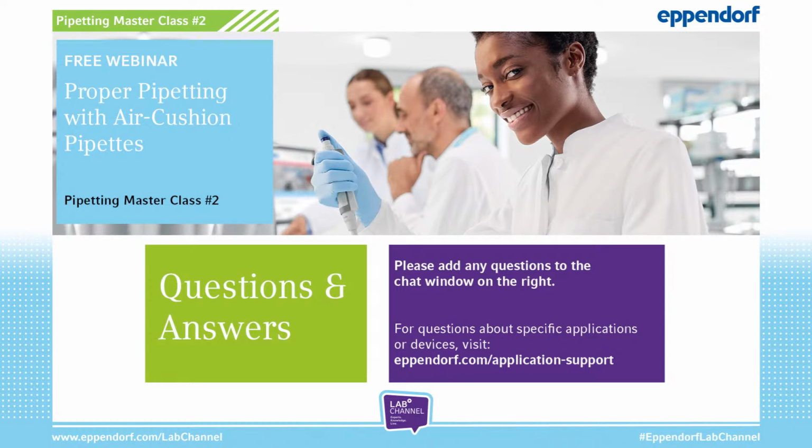And maybe related to this, I can add something based on a question we often receive, whether we can use air cushion pipettes just for aqueous liquids. And here I would put it differently. Air cushion pipettes are primarily suitable for aqueous liquids due to their functional principle, the air cushion.